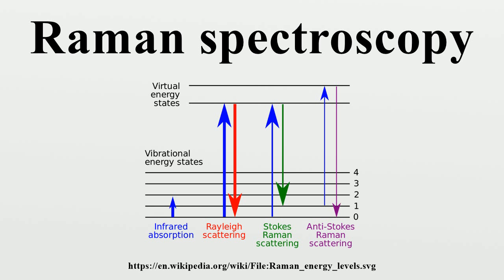However, the intensity of near-infrared Raman is low, and most detectors require very long collection times. Recently, more sensitive detectors have become available, making the technique better suited to general use. Raman microscopy of inorganic specimens, such as rocks and ceramics and polymers, can use a broader range of excitation wavelengths. Polarized analysis. The polarization of the Raman scattered light also contains useful information. This property can be measured using polarized laser excitation and a polarization analyzer.